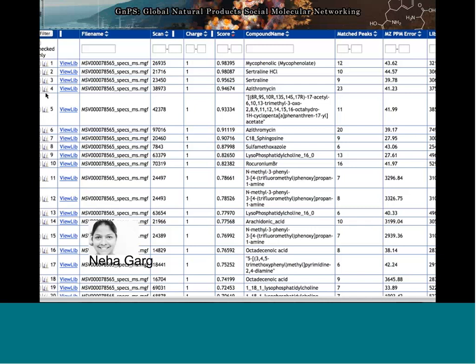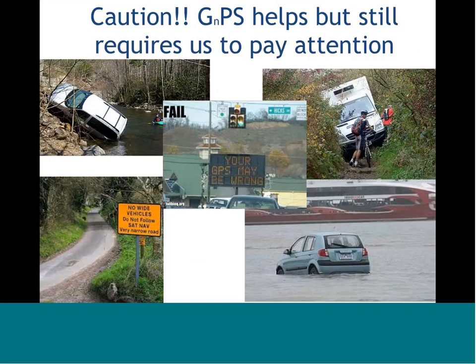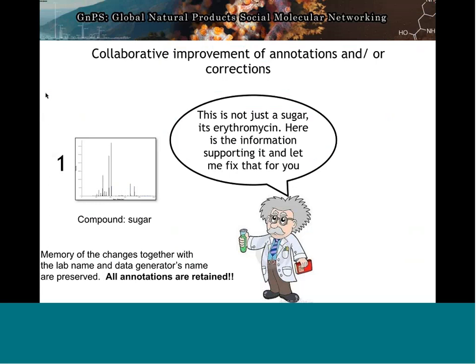And to me, that's really exciting, and it changes the way we actually interact with data. But of course, when you rely on automated tools, mistakes are going to happen. It could be that there's an incorrect annotation, or an annotation that needs to be refined. And so there's a couple of solutions to this, so that while mistakes will be made, it still enables us to provide higher confidence in the annotations that we have.